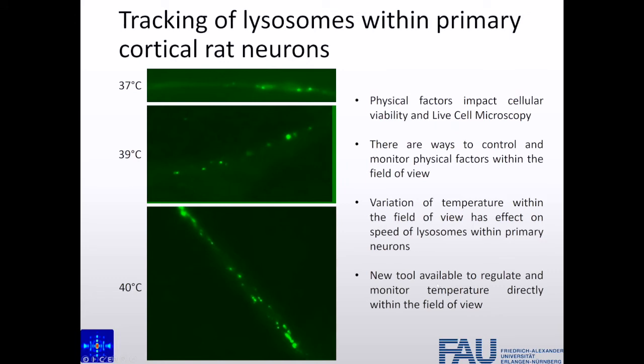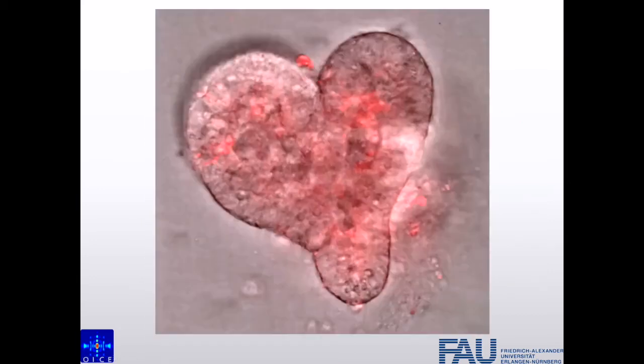And as Daniel was showing, there's a new tool available to regulate and monitor temperature directly within the field of view, which was one of the factors that was hard to assess directly in the position where you image. But now with this tool we are able to do that, and I was really astonished that there's so much impact. With that, I'd like to end, and I'd love to get your questions after Mart's talk.